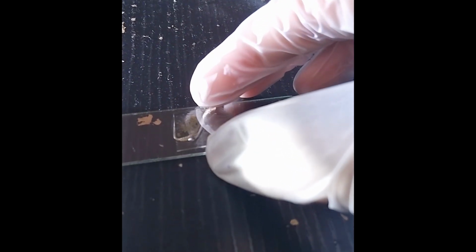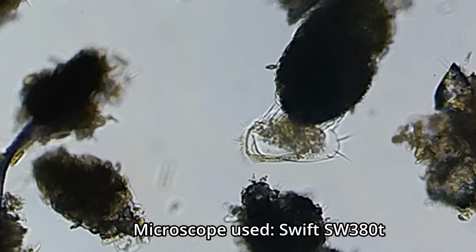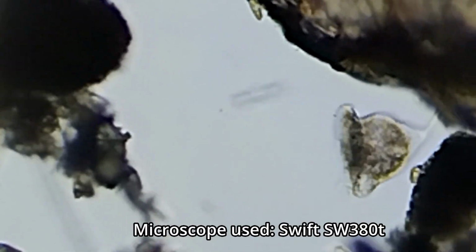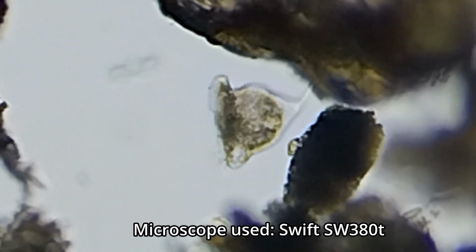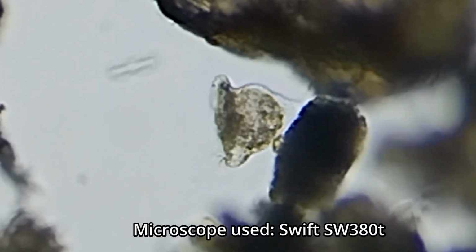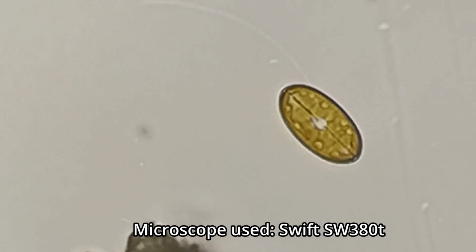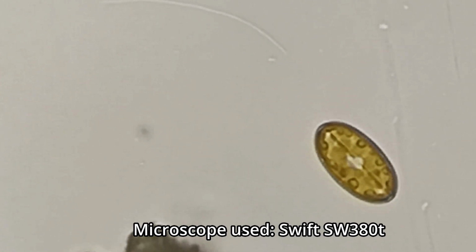This one consists of mostly stones and algae, so I used a pipette to collect some of the algae that settled in the bottom of the jar. Then, I placed it on a slide to observe it under the microscope. Here is what I saw. Firstly, this ciliate. It likely belongs to the genus Euplotes. And secondly, this peritrich ciliate. Unlike the other ones, this one is on its own. It is not a part of a colony.